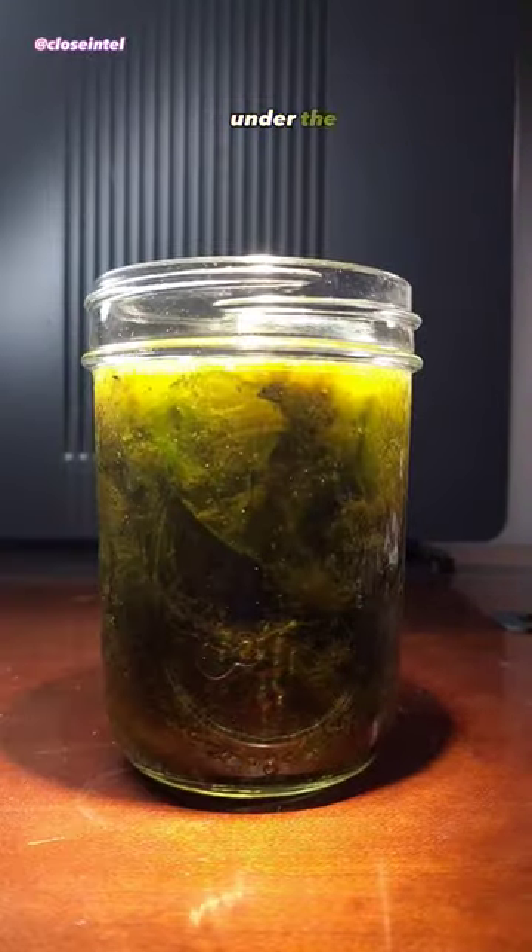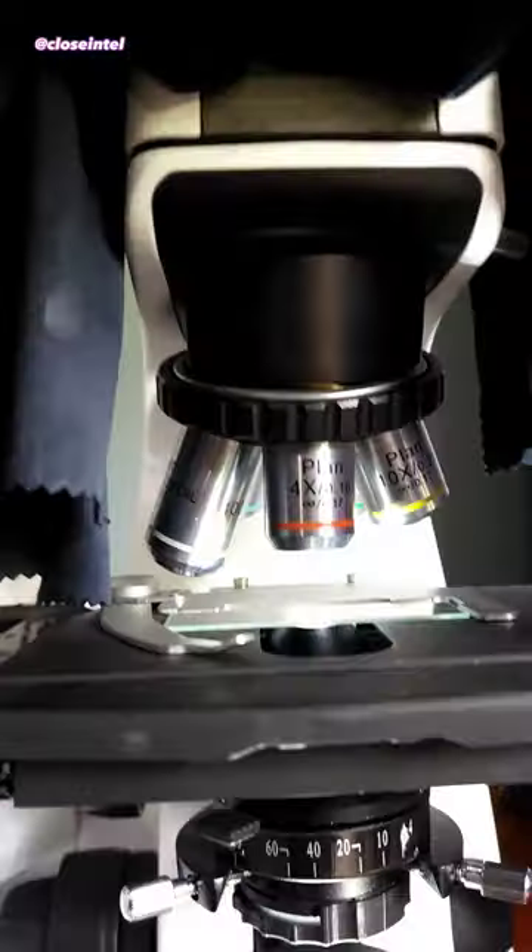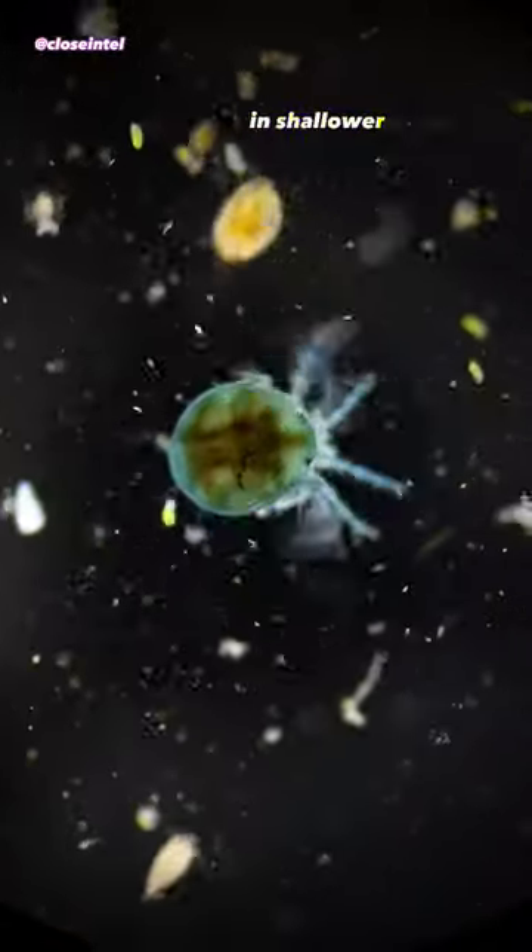Today I'm going to show you a water mite under the microscope. Water mites can be found in almost all freshwater habitats, attached to algae or some kind of vegetation in shallower areas.